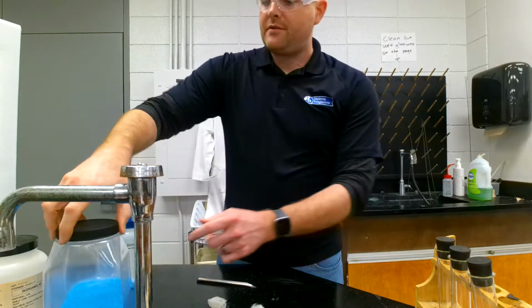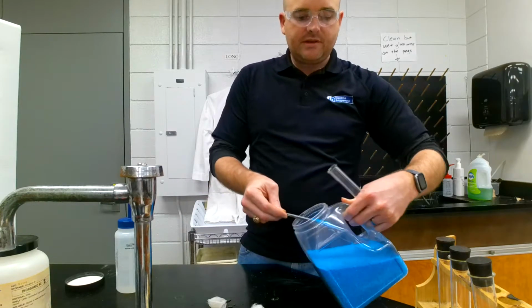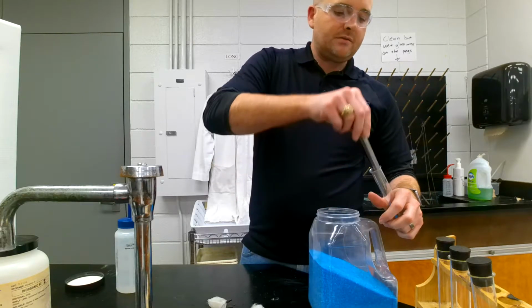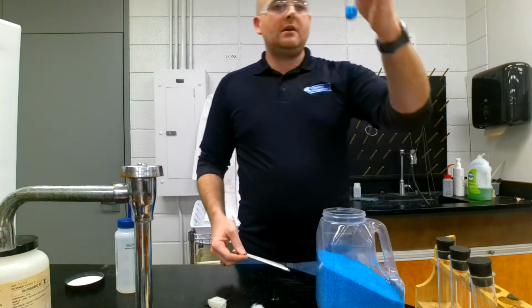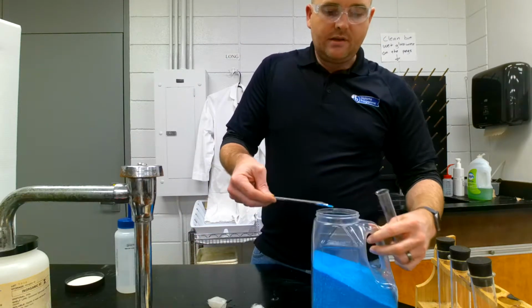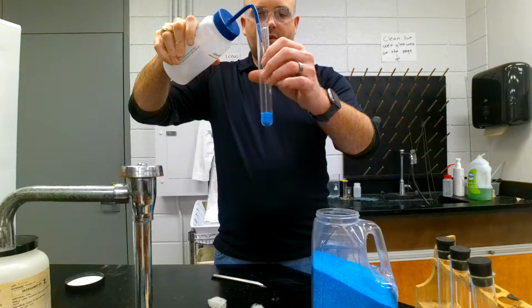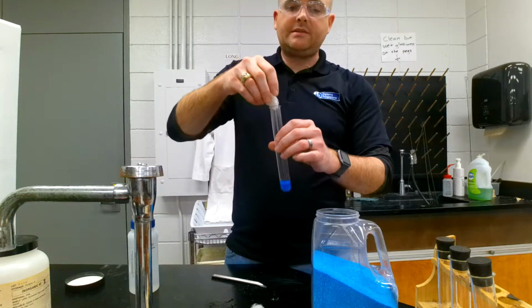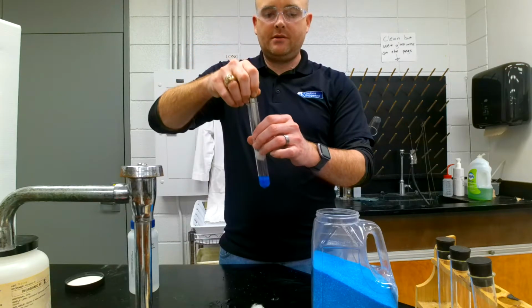So now for the bottom, the procedure says to put about 2 centimeters of copper sulfate on the bottom. So that's about an inch. Yeah, 2.5 centimeters is an inch. So something like that. Okay? Not a lot, but enough. And then it says to fill it with water up until it gets to the top, and then I'm going to take one cotton ball and stick that one in there. Ooh, it makes a cool sound.